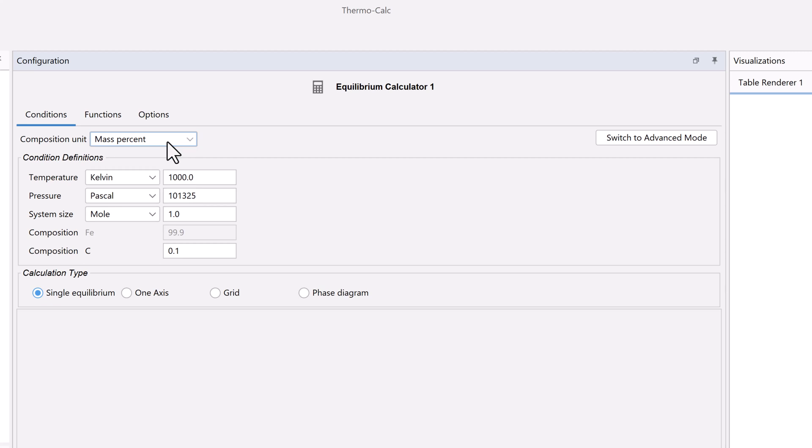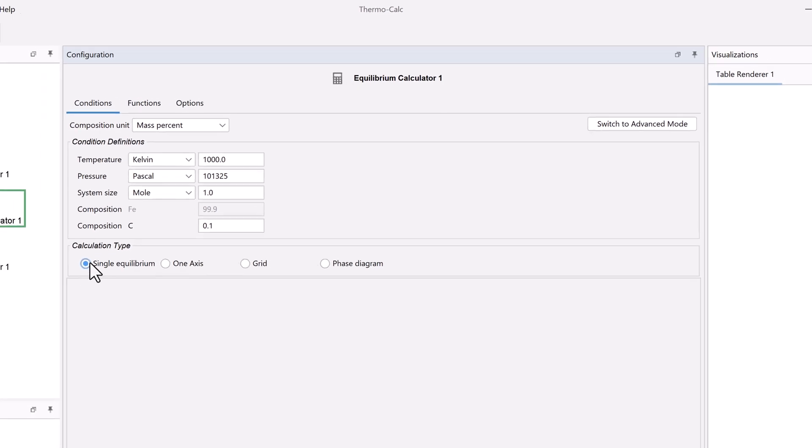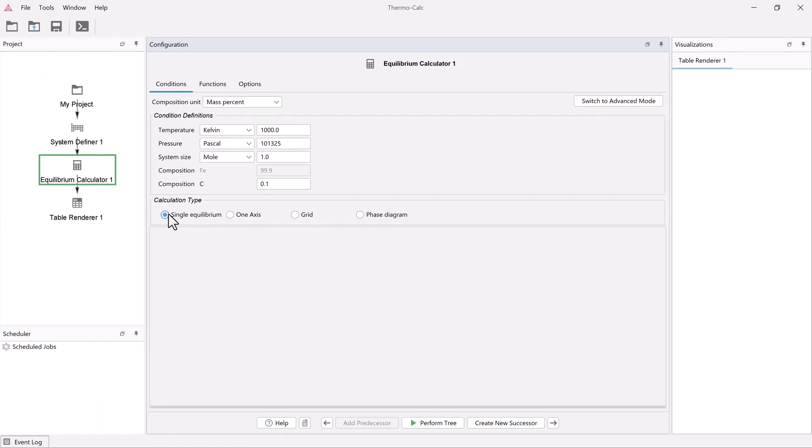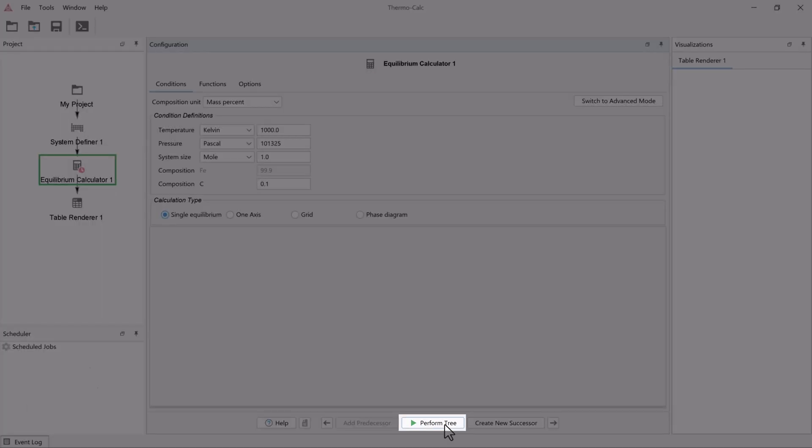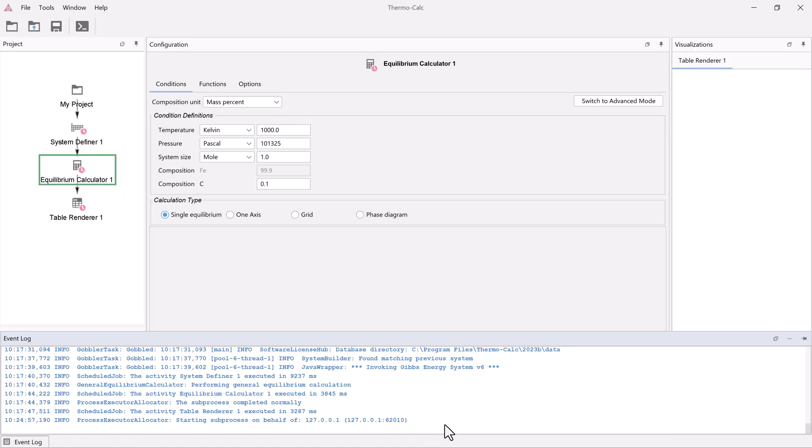Next, we need to select our calculation type. Since we are using the single point template, single equilibrium is automatically selected, so you can leave this as it is. Our calculation is now configured, so click perform tree at the bottom center of the program.